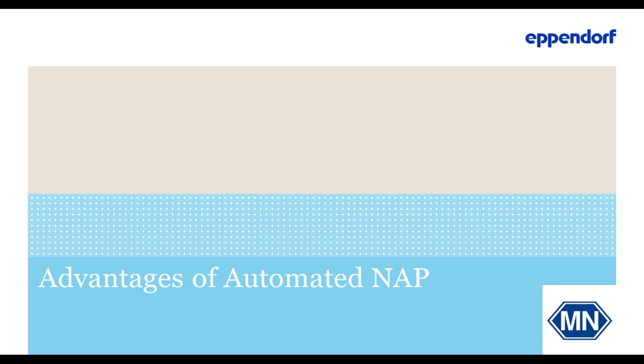Okay. Yeah, thank you, Milan, for this fantastic presentation. I'm going to take over from here, and in the next 15 minutes or so, I'm going to give you a little insight on how to automate nucleic acid purification. So basically, how to get those principles that Milan described previously into an automation background.